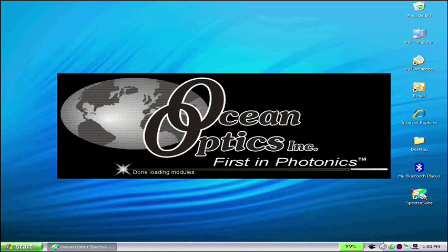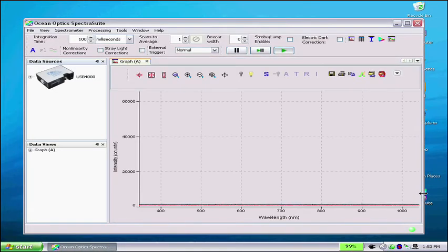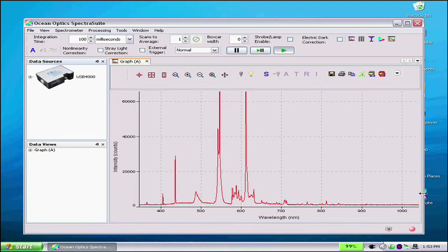Your final step is to point the Spectrometer's aperture toward the light. Check that SpectraSuite shows a dynamic trace on the graph. This should rise with increasing light intensity. That means the hardware and software are now correctly installed.